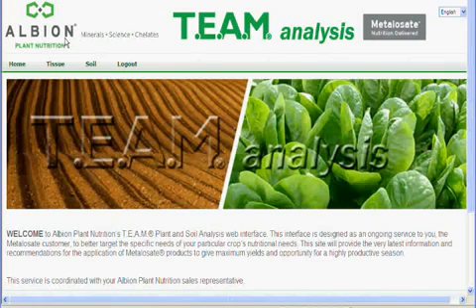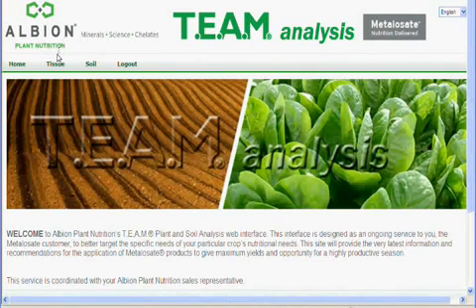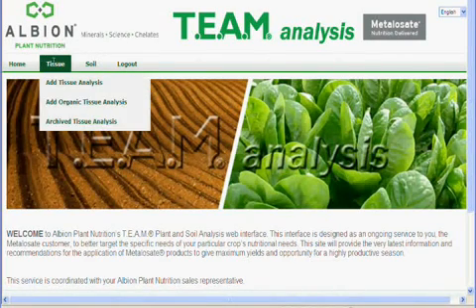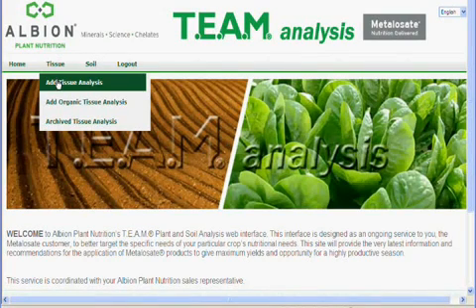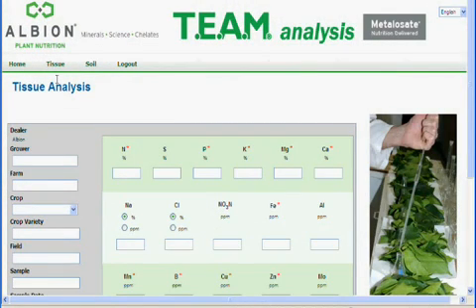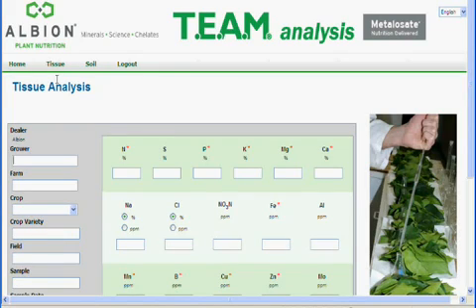To enter data for tissue recommendations, click on Tissue on the menu bar, and then on Add Tissue Analyses to see the tissue analysis data entry page. This is the tissue analysis page, where you will input all the data important to the sample. Your dealer name should appear here.